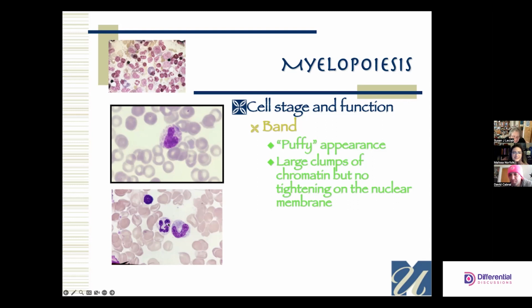Look at the edge of this. It's dark. It's thick. That aggregate takes up much more space than the aggregates here. You got more of them here. Very, very dark. And these openings down here, they're not actually euchromatin as much as they are, I don't know, air pockets in the sausage.